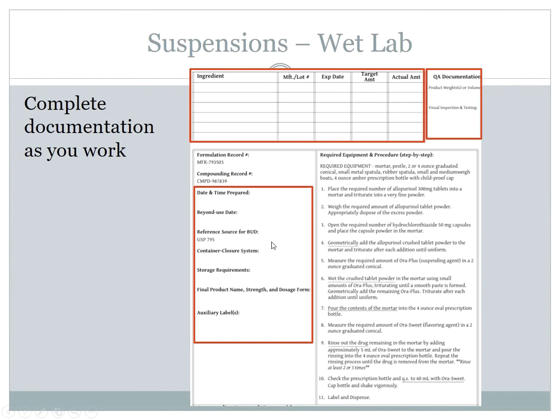All right, 2 lines. Hydrochlorothiazide, you only need the 1 line for the number of capsules. So just be careful with your documentation. We're looking at that. Definitely write out a full QA and everything else. I'll remind you, including all of that. Part of checkout today is us going through your entire worksheet to make sure you got everything for the exam. Beyond that, you're going to make it. So to get out of lab, you have to make your product and complete all of your documentation.